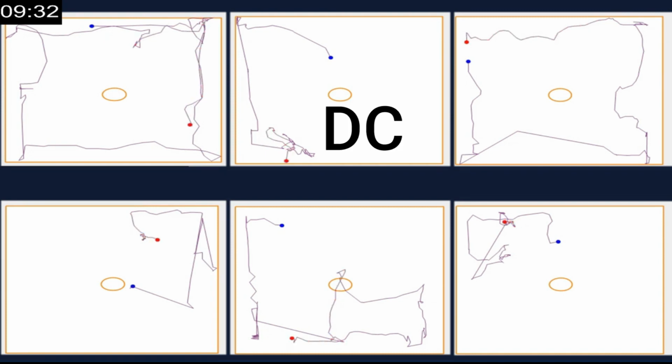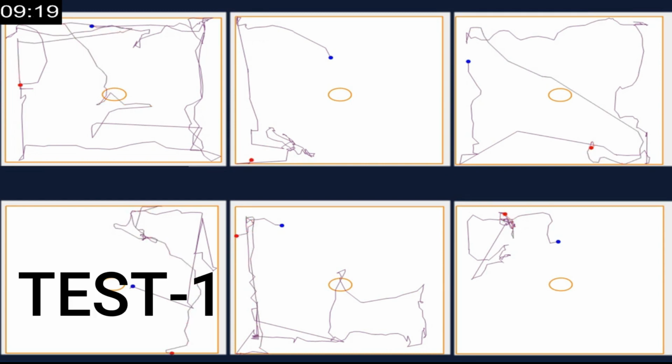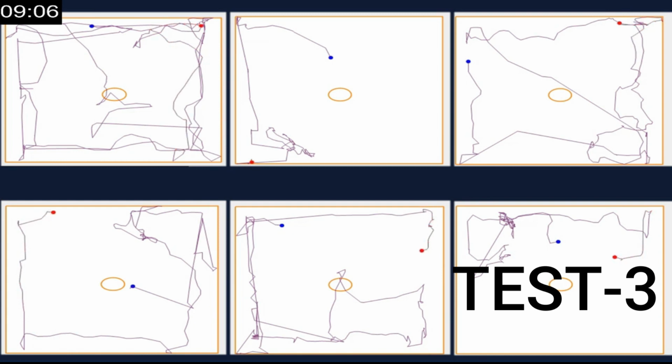It should be painted brown on all sides, and a webcam should be attached to the ceiling and connected to the recording device, and especially software known as motion tracking software. Next, you have to check how much light is present in different parts of the box.